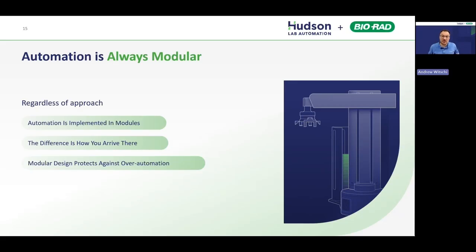And you need to keep that in mind, because that has impact both in terms of how you build these systems, it's how you maintain these systems, it's the day-to-day operational impact, right? That you end up having a lot of modules, so there's a bit of a learning curve associated with them. But one of the main huge drivers of value in this is that it allows you to build these systems a piece at a time, right? And address your highest value needs first.